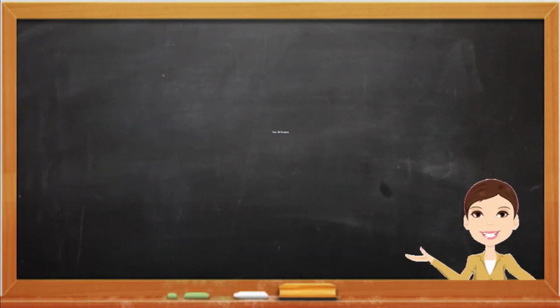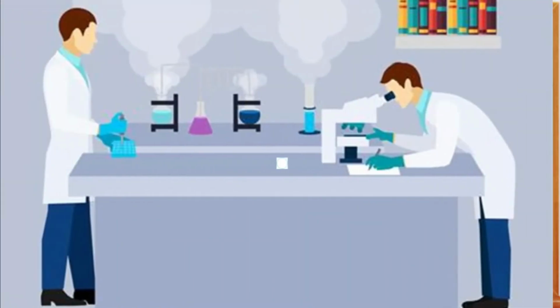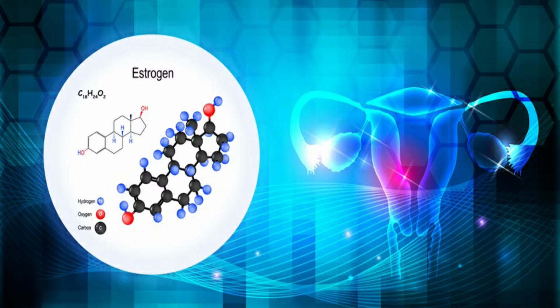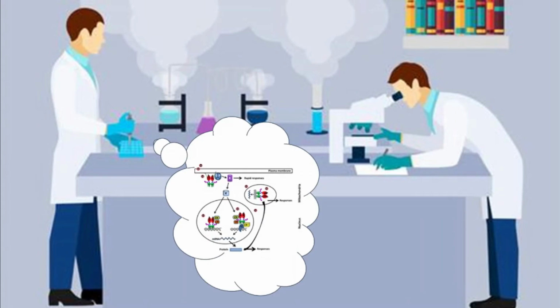Now that we know what ChIP sequencing is, let's talk about a real-life application. ChIP sequencing has been used to identify important interactions between chromatin and estrogen receptor binding sites. Estrogen is a steroid sex hormone that directly targets DNA and affects gene expression, leading to multiple changes in the body. Our growing understanding of such links helps us discover the molecular mechanisms and bases of disease.